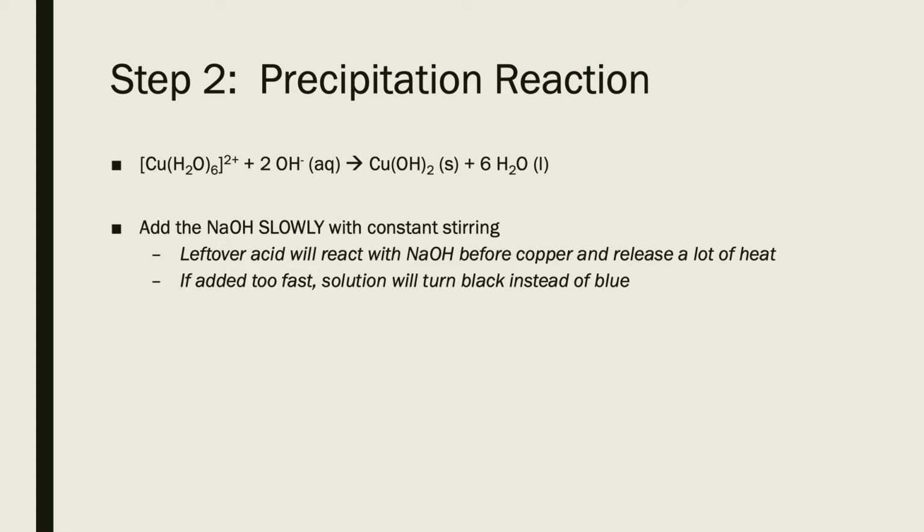We don't have huge volumes here again. But if you want to, we have gloves available. By all means, just wear gloves in the first 2 steps, and you don't really have much to worry about there either. Now, when you're adding the sodium hydroxide for this reaction step, for the precipitation reaction, you do want to do it fairly slowly and with constant stirring.